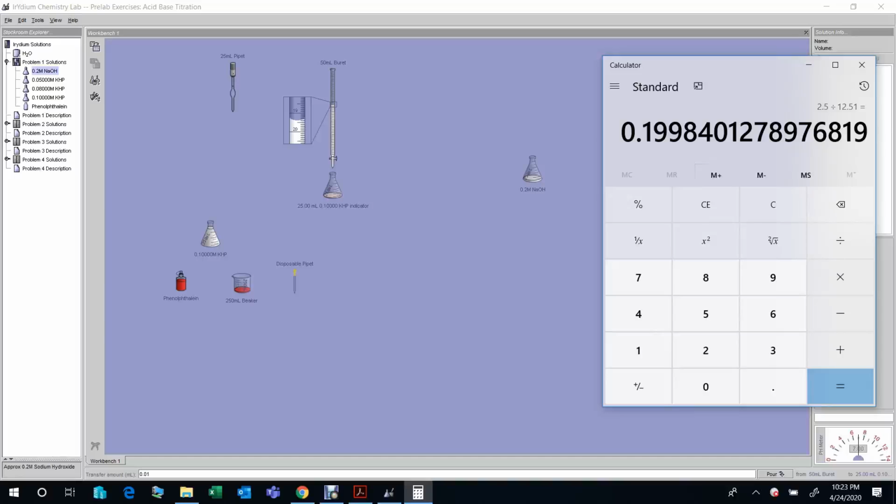In the real experiment, when we add solution as we approach the equivalence point, when sodium hydroxide is dropped into the solution, locally some solution will change its color, and that tells how close the titration is to the equivalence point. But here we cannot see that. So that's the reason I added 0.02 milliliter in a very careful way. We don't want to overshoot.